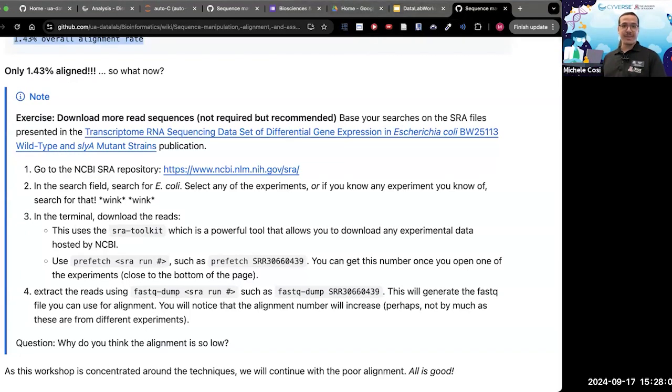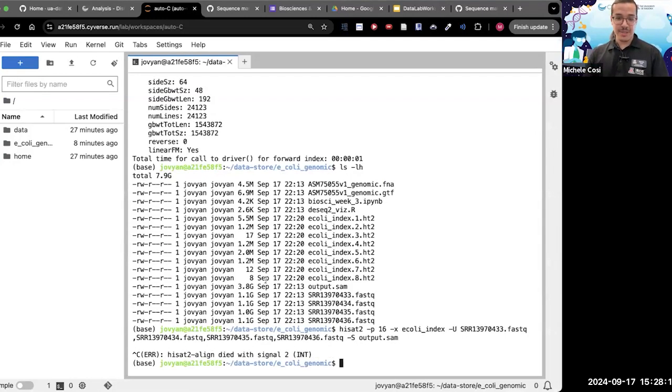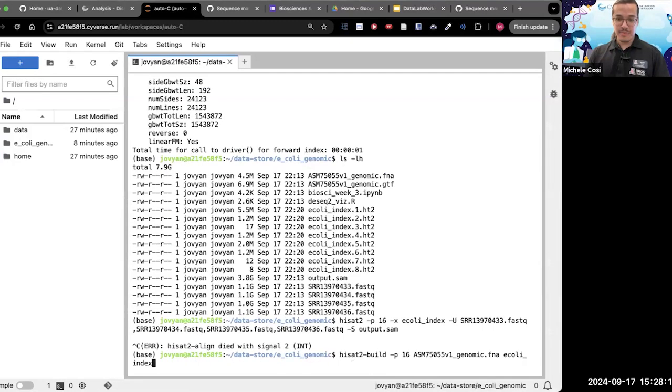So I'm going to go back to the run over here. It's still going. I'm going to stop it because it's going to take a little bit longer. And I am just going to download it again. Oop. You should not need to do this.